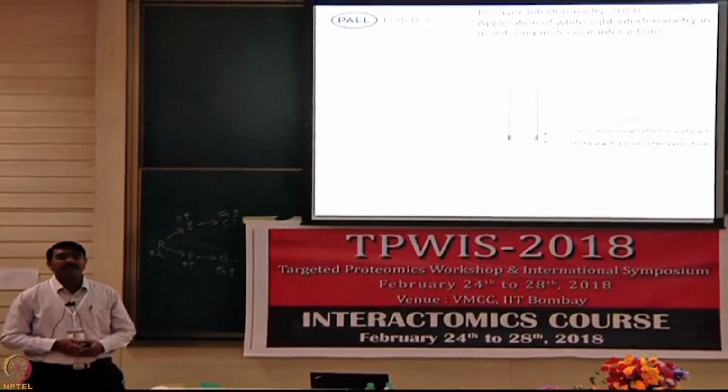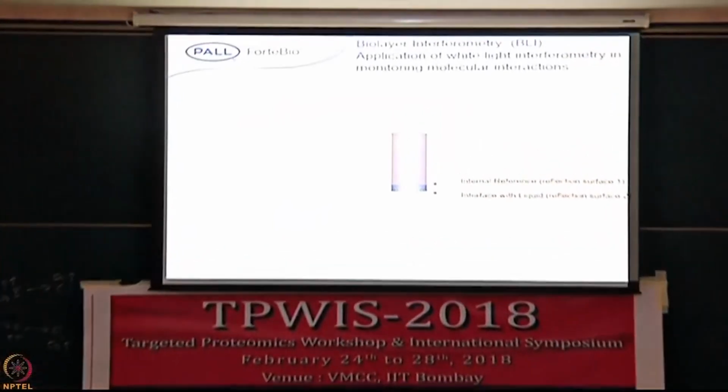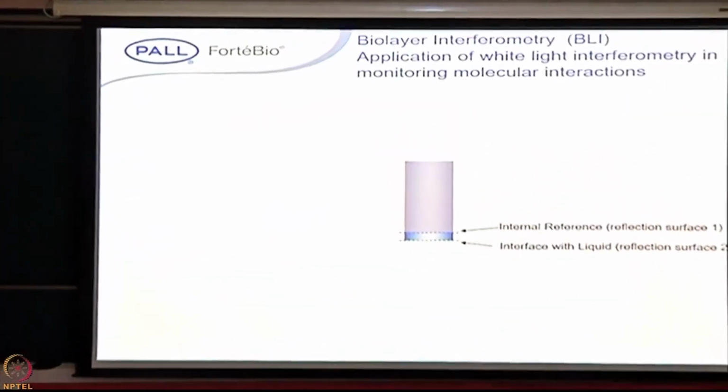So what exactly is the principle behind this? As I mentioned, it works on interference. Sorry, going back to that previous slide.